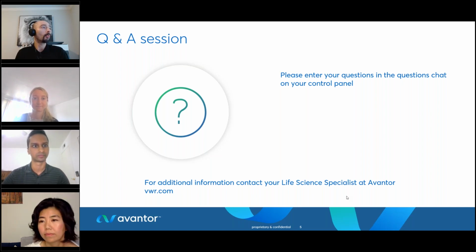And Aaron, what about the workflow? If you are not using the rapid barcode kit, can you still use a normal kit to do plasmid sequencing? Yeah, definitely. If you've linearized your sample upstream of starting the library prep, those reads can definitely be taken into our workflow. Thank you.